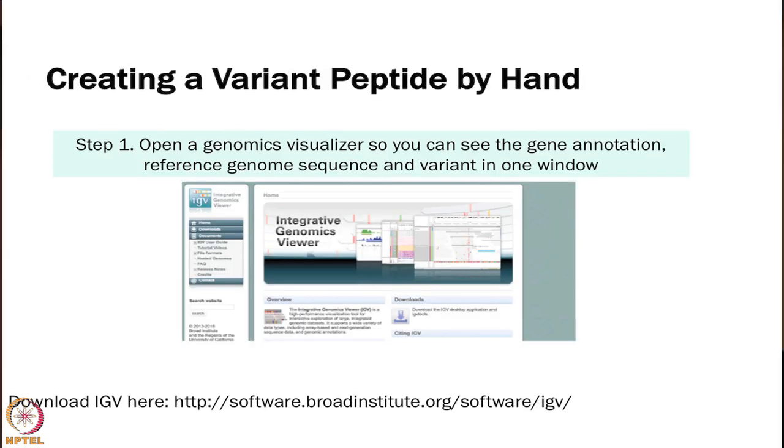Okay, so this is where I wanted to kind of walk through what we're going to do on the hands-on before we actually do the hands-on. We'll see if that helps with the actual hands-on. You're welcome to try and follow along, but let's wait for questions until the actual hands-on. I just want to show you what we're going to be doing, and we're going to use a different example for the hands-on itself. So if you haven't downloaded IGV, please do so.